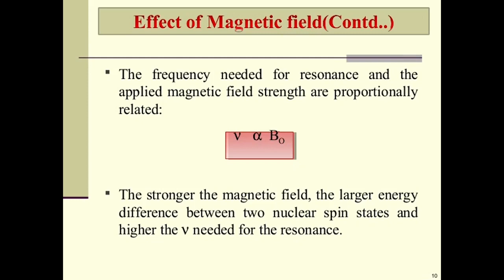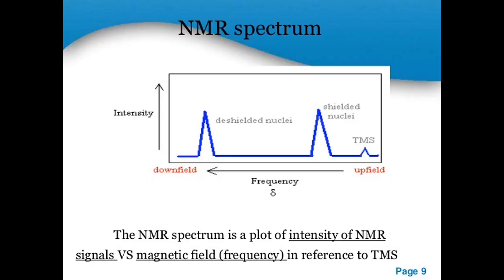Okay. And also about the technique. This technique consists of exposing the protons in an organic molecule to a powerful field, and the protons will precess at different frequencies. We know that the molecule contains several nuclei. Some of them will be NMR active and others will be NMR inactive, and the NMR active nuclei will begin to precess at different frequencies.